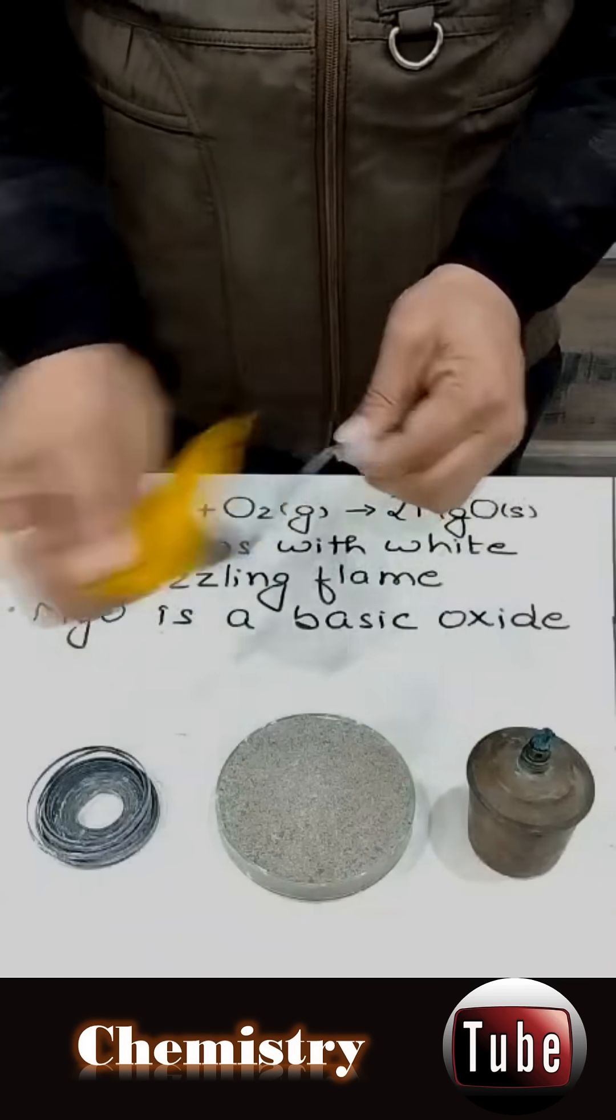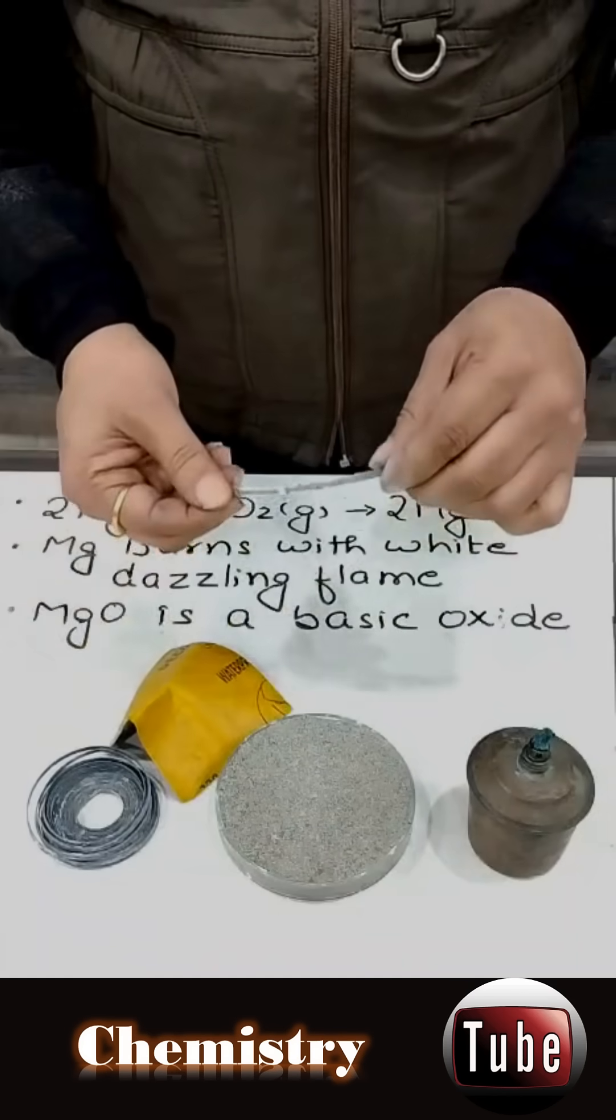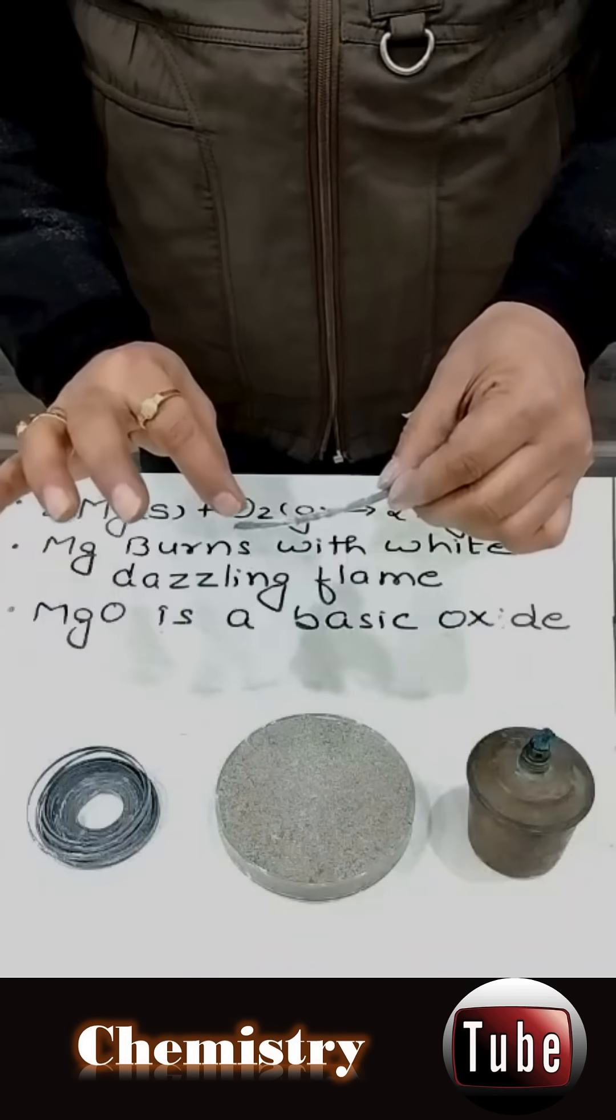You need to rub this magnesium ribbon with sandpaper until it gets back its luster. Now you can see that this magnesium ribbon has got its luster back.